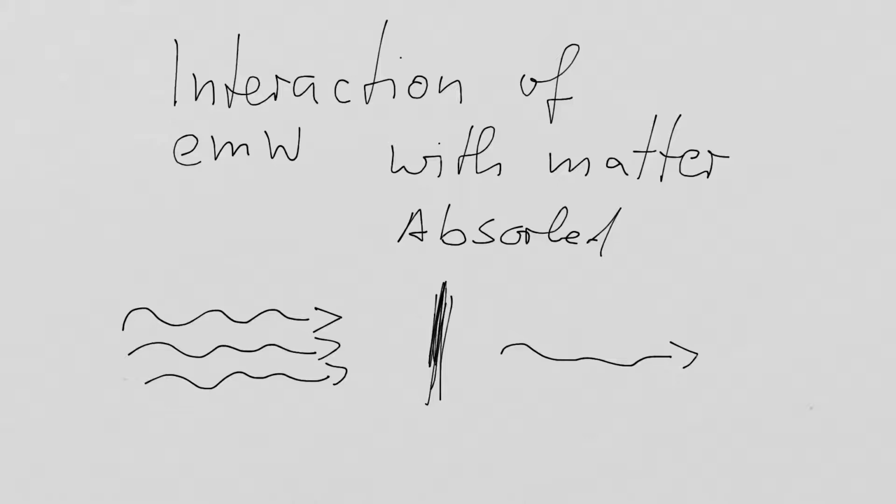Well, the answer is, in a way, trivial and not trivial. Electromagnetic waves, like light, but also like any other waveform, are just simply forms of energy. In this case, we shoot energy, and energy then is absorbed. That's a very simple explanation. A little bit more in-depth explanation is that we need to have exactly the right amount of energy to do something. Why is that?